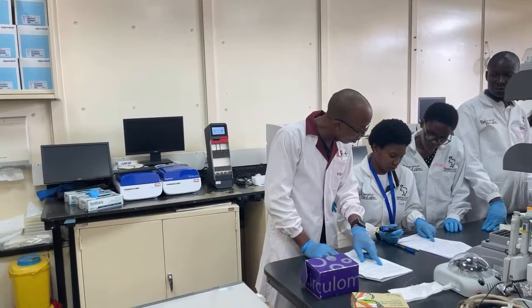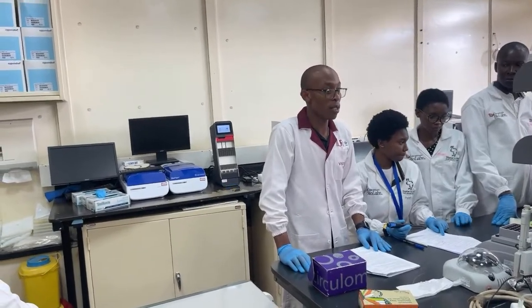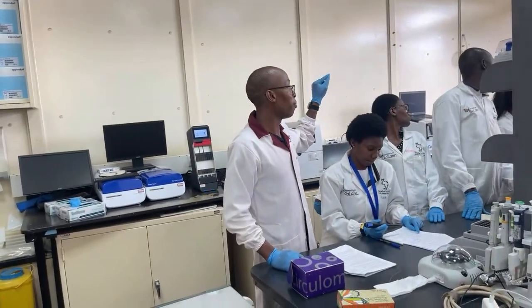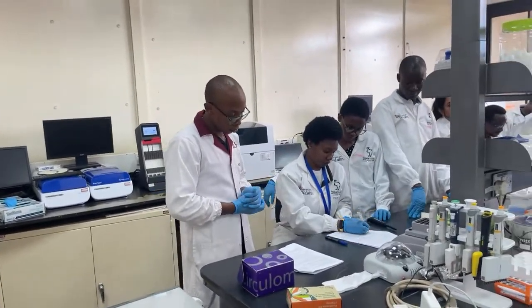Oh, yours says 300. It's just that there are so many things. Okay, it's happening. 300 microliters of supernatant, okay? Good. So again, go in there one by one. One by one.